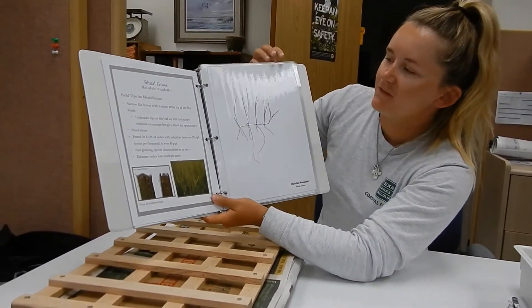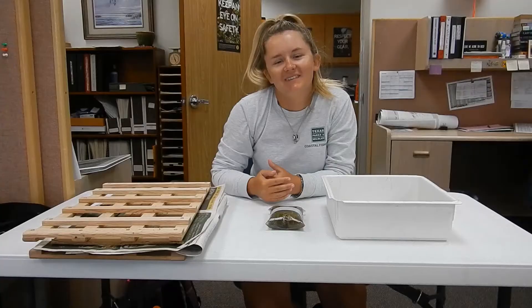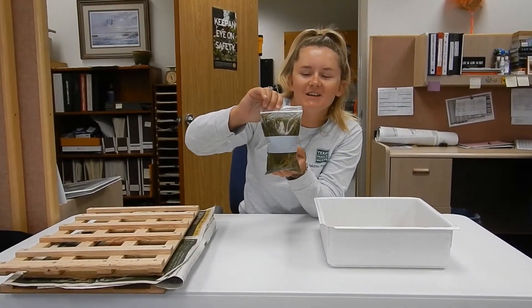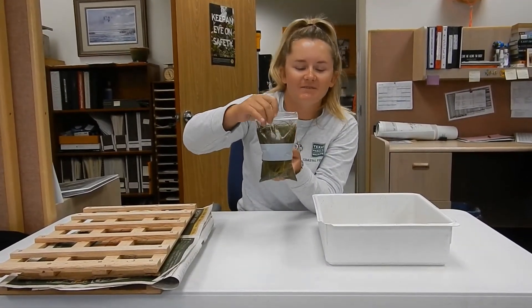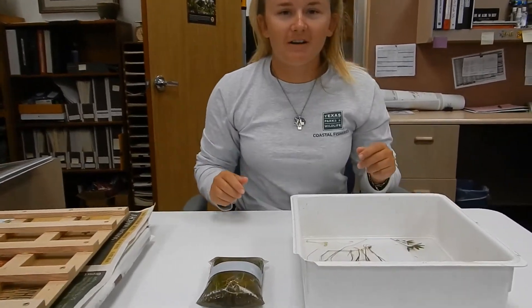Here's an example — this is an example of the shoal grass that we collected. Here is some seagrass that we had collected in the bay earlier this week. I'm going to show you how we start to prepare it for the press.